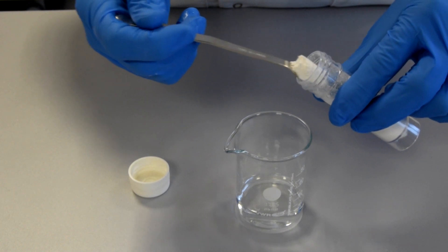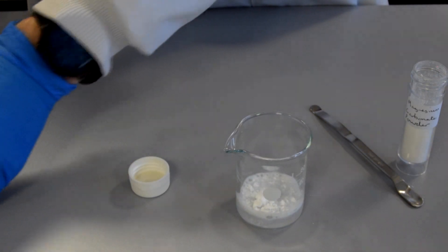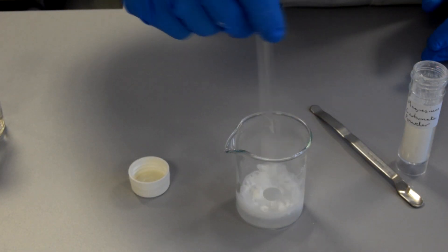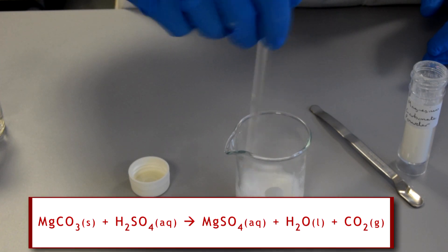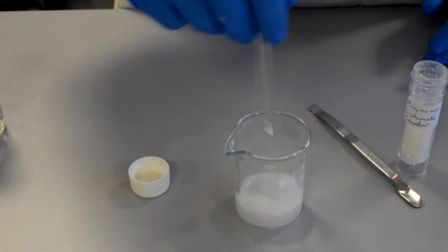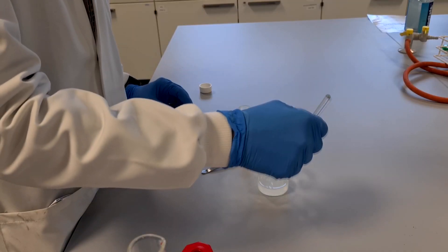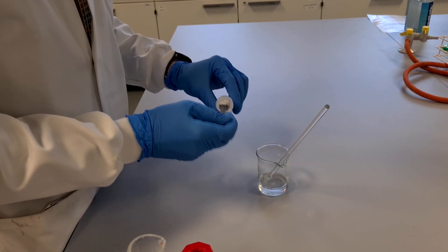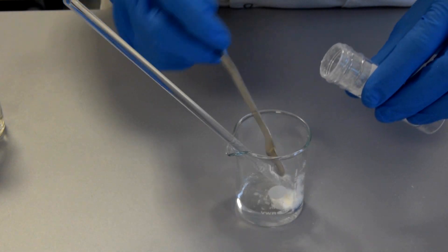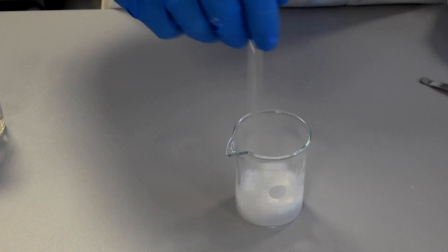We should see effervescence as the carbon dioxide gas gets released, and you can see that quite clearly there. Give that a stir to ensure it all reacts, and we can see it's all reacting - until all the magnesium carbonate and sulfuric acid have reacted together, and no more magnesium carbonate will react.